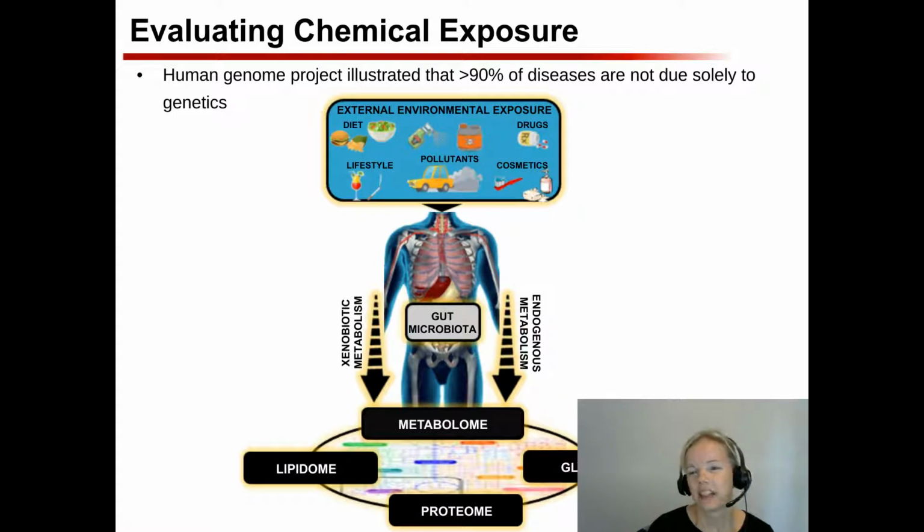However, we know that it's not just the metabolome, because if we look at those specific molecules in the KEGG pathway, some of them are glycans, some of them are lipids, and there's those proteins or enzymes that are causing these different changes to occur. So doing a multi-omic evaluation of how these xenobiotics are processing through your body is very important. And what we call this is, if you're looking at specifically the xenobiotics and their transformation, those are direct measurements of exposure. Well, if we're looking at these other omic analyses, those are indirect measurements because that's seeing how the other molecules are affected by the exposure.